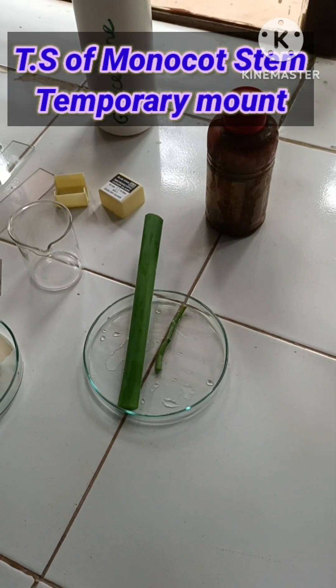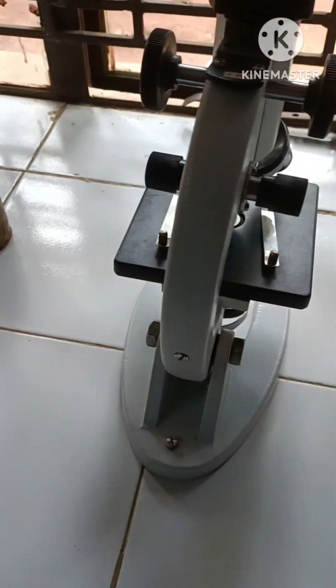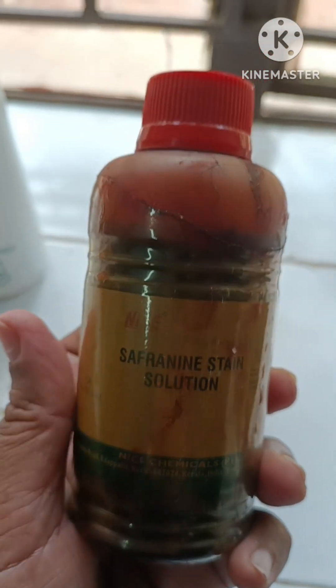So we are going to take the TS of the stems and we are going to observe under microscope after staining with the help of safranin. Safranin is the stain we are going to use here.